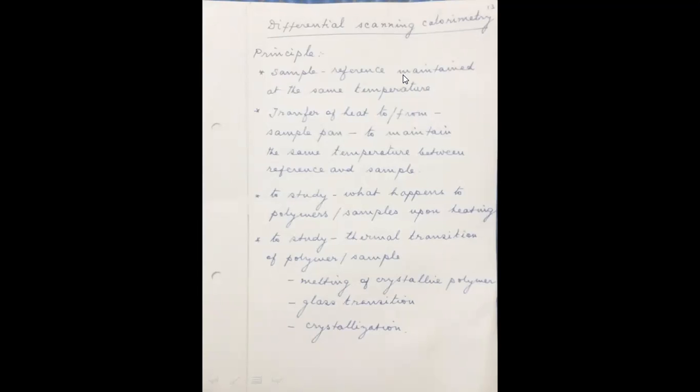Actually, it is not going to reveal the actual mechanism taking place inside the samples, but it will give you only the quantity of the additional heat energy to be supplied, or the heat energy to be taken off from the sample, to maintain the same temperature as the reference. So this gives you enough information to understand the mechanism of what is happening in the polymer and in the sample. Say, for example, melting of a crystalline polymer.